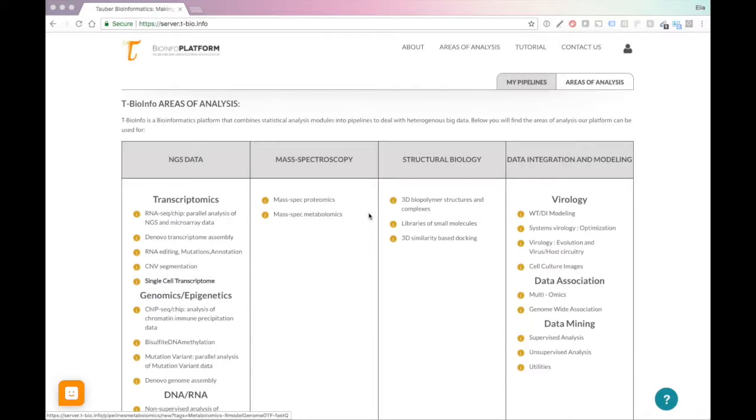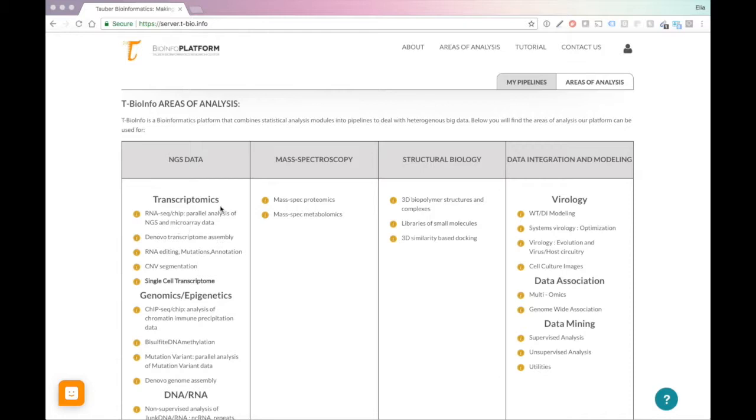In this video, I want to show you another way of making a PCA plot and working with the platform. What we did is we processed the data here under Transcriptomics RNA-Seq. We got the table of expression, and we maybe did a normalized quantile normalization under utilities.